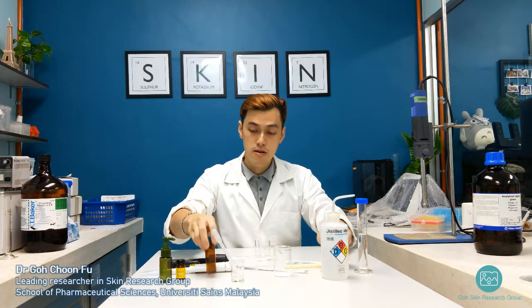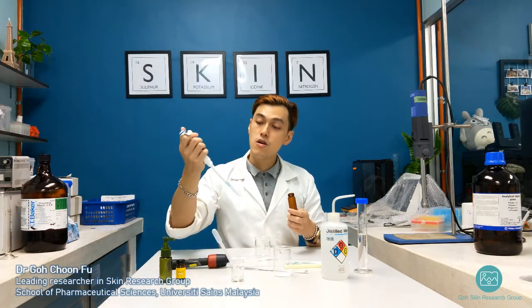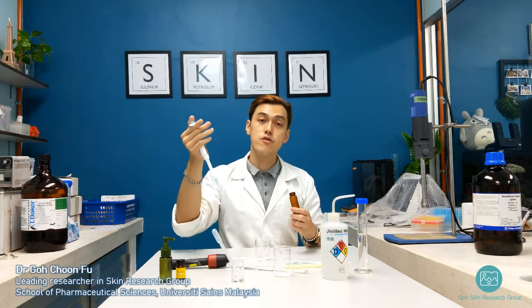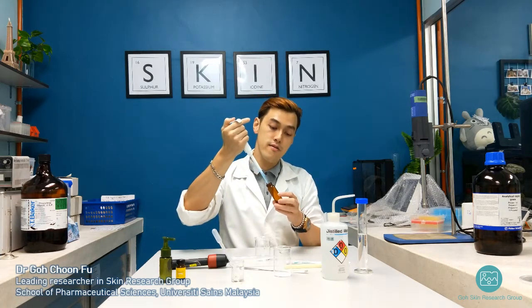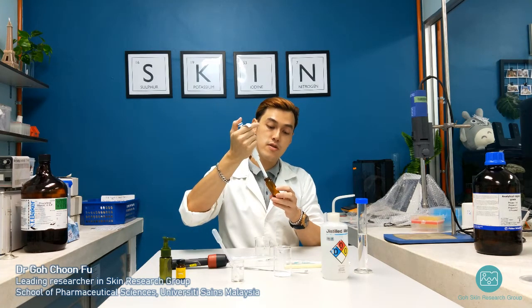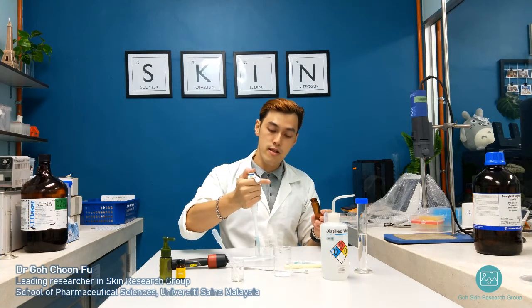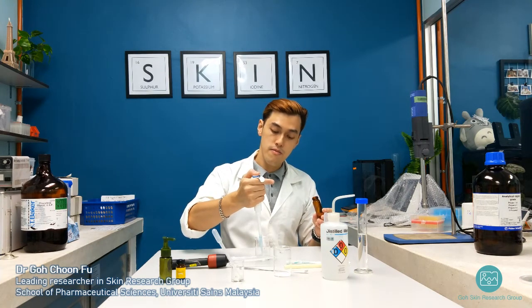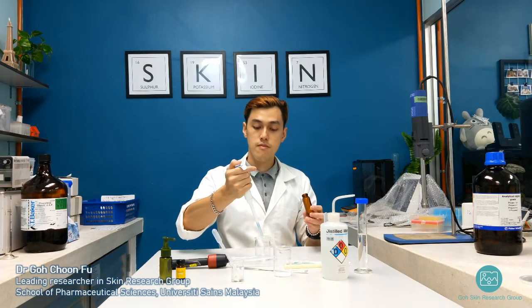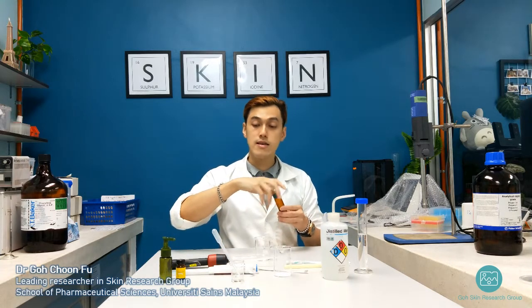what we can do now is add propylene glycol. If you have a pipette at home or in your lab, you could use it to measure more accurately. But if you cannot access one, it's still wise to use a measuring cylinder or any measuring equipment that is able to measure things correctly. So now we have all the water-based ingredients added, except the alcohol.